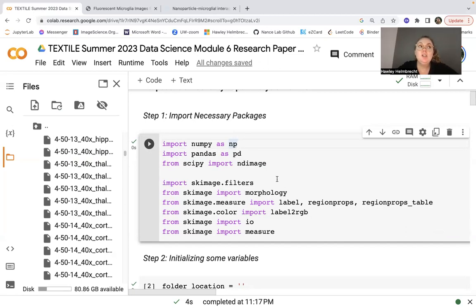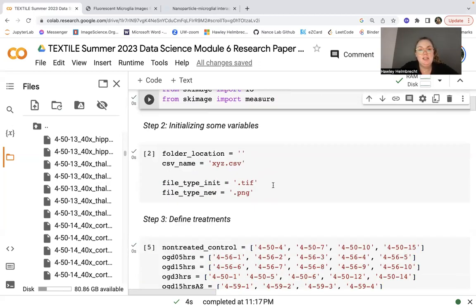But some of our newer experiments are pushing the boundaries of what you can do on a personal MacBook, although the new MacBooks are quite nice and I think they could be run on that. So just be cognizant of how many images exist in your experiment and how large their file sizes are, because that will really change things.